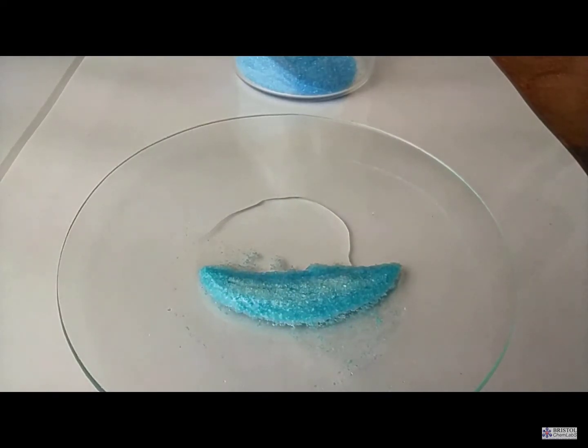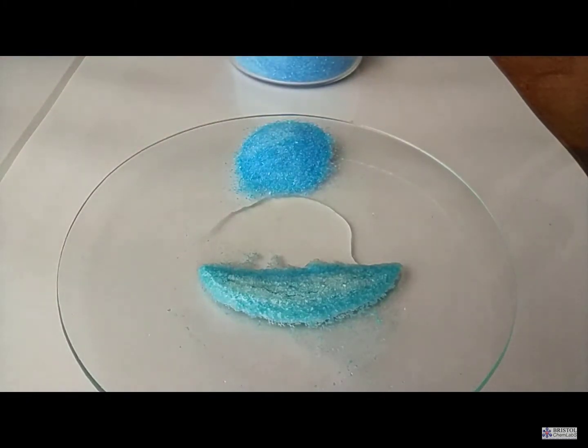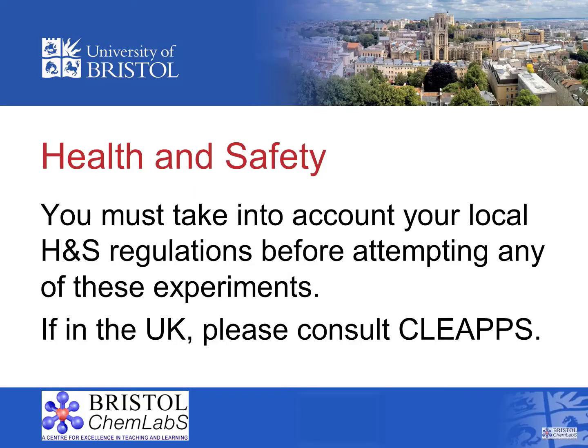Adding water to acid liberates a great deal of energy. With sulfuric acid, it's always better to dilute concentrated sulfuric acid by adding the acid to water and not the other way round, so that steam doesn't form and potentially blow out the acid into your face.